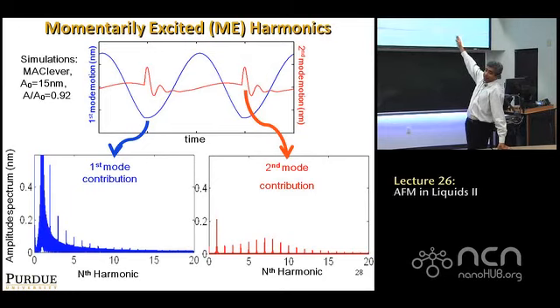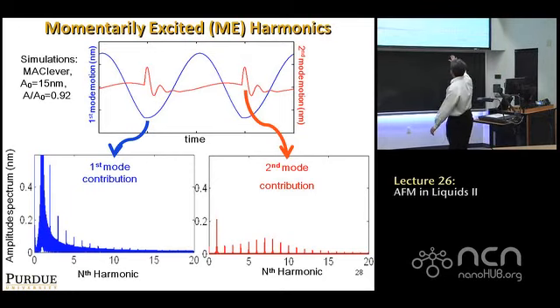But nonetheless, the key point is that the pulse that you see in the red curve happens once every oscillation cycle, so if you do a Fourier analysis, the fundamental frequency of the red curve is also going to be at the drive frequency because it happens once every drive cycle. So the drive frequency is the fundamental frequency if you do a Fourier transform of it. And if you do a Fourier transform, you actually find the red curve shows higher harmonics of the drive frequency, which reach a maximum value near the second bending frequency of the cantilever.